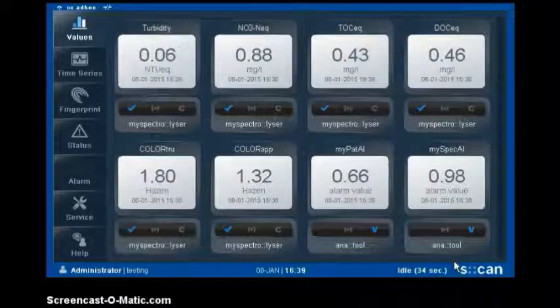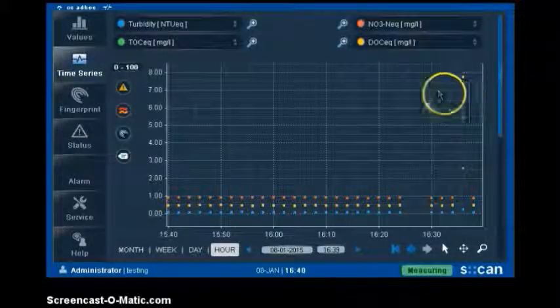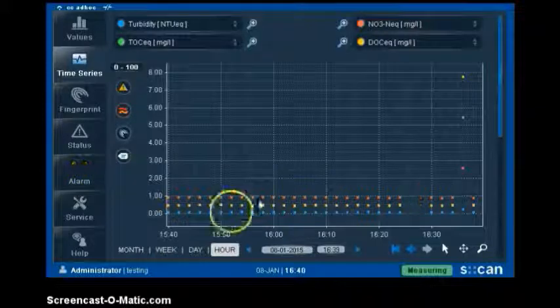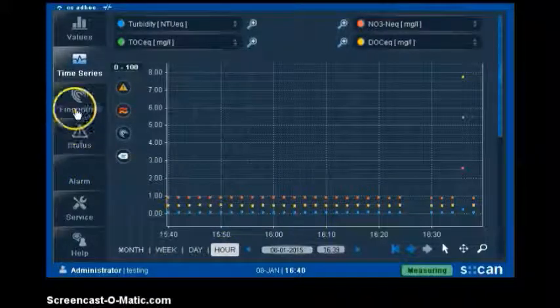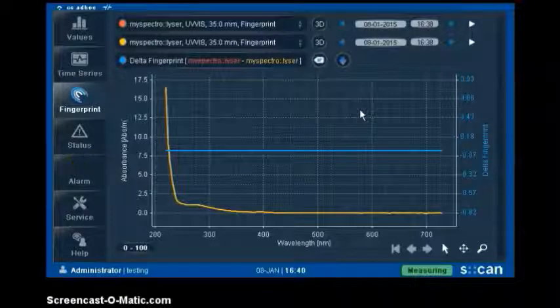We can maybe now have a look at the fingerprint and the parameters to check the event and analyze what was happening here. First step is to have a look at the time series. We can see that most of the parameter values were changing relatively strong due to the coffee in the reference slide. We can also see how this is visible in the fingerprint.